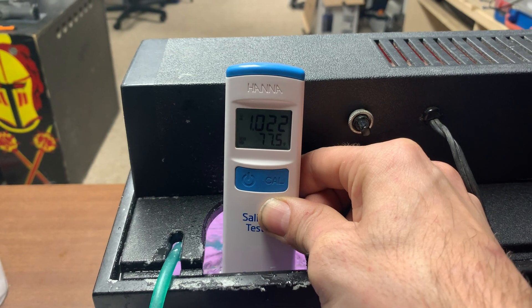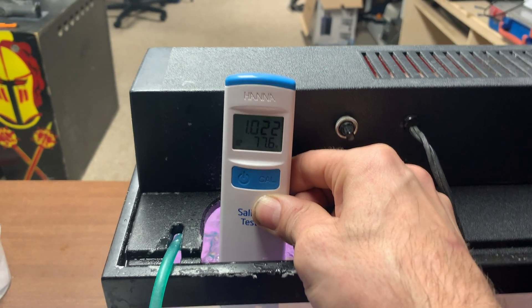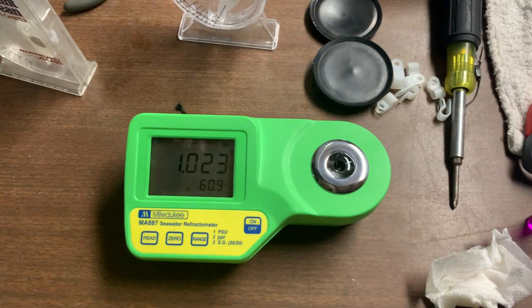So here we go. We got 1.022, which is what I know it's going to stay at. It's all calibrated. Now this one here — that's the same water — and it pulled up a 1.023.